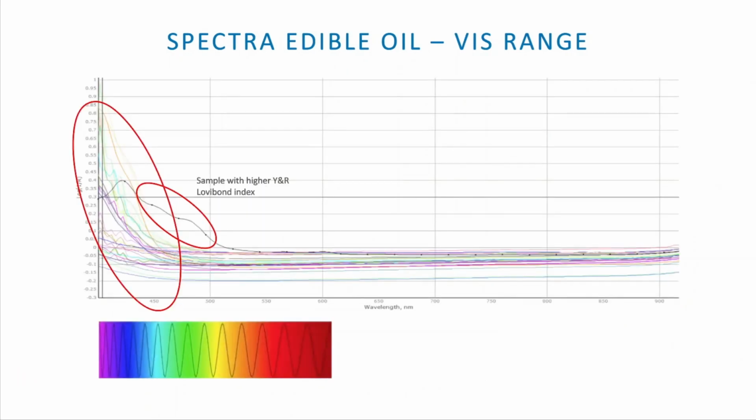Color calibration works best in the visible range. These spectra could be mistakenly assumed to be in absorbance. The problem is the Lovibond reference method, which cannot be physically reproduced with an optical path of 5 millimeters. The typical approach of the NIR range was therefore chosen.